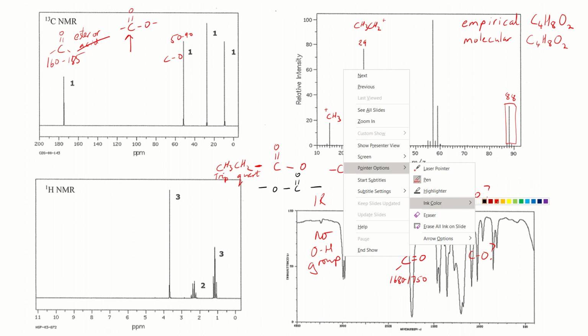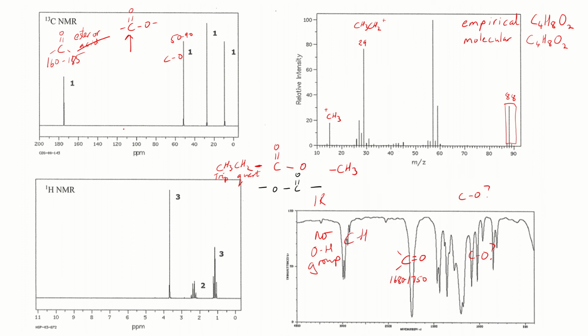Now, for how to figure it out then, what we are going to look at is the chemical shift of these peaks. So if we look at the singlet first, the singlet we know is this CH3 because whichever one of these it's next to would not split it. There's no hydrogens there. So the chemical shift is around 3.6-ish.